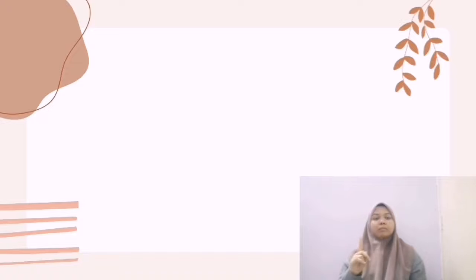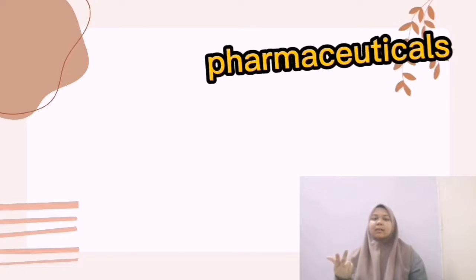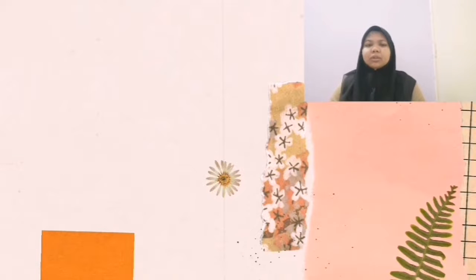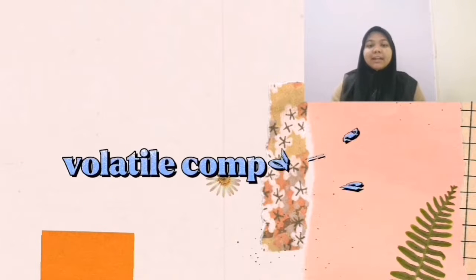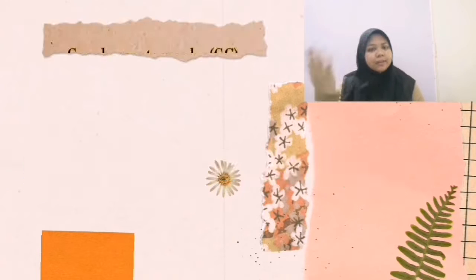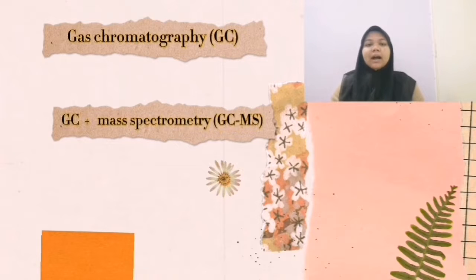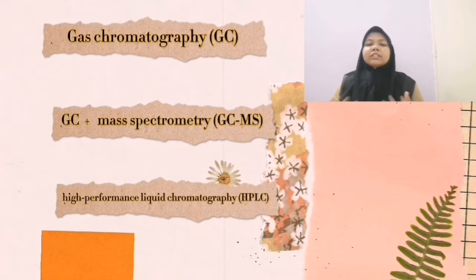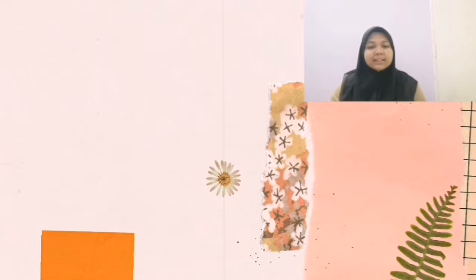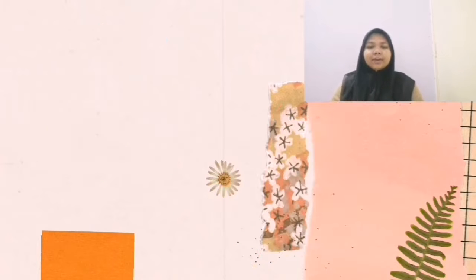In this part, we will discuss the presence of the vanillin peak. Vanillin is one of the most widely used flavor compounds in food, beverage, pharmaceuticals, perfume, and medical industry. Various analytical techniques have been reported to identify trace amounts of volatile compounds. Many conventional methods are based on chromatographic techniques such as gas chromatography, which is GC, GC coupled with mass spectrometry, GCMS, and high performance liquid chromatography, HPLC. Among them, GC and GCMS have attracted growing interest in the qualitative identification and quantitative measurement of volatile compounds.